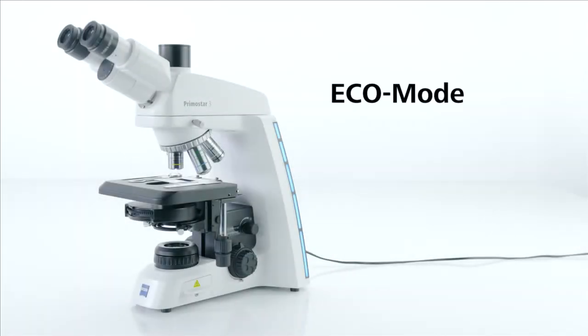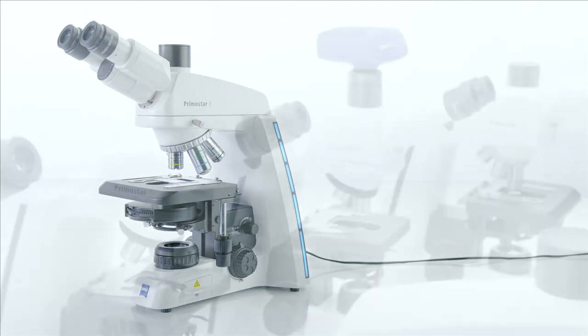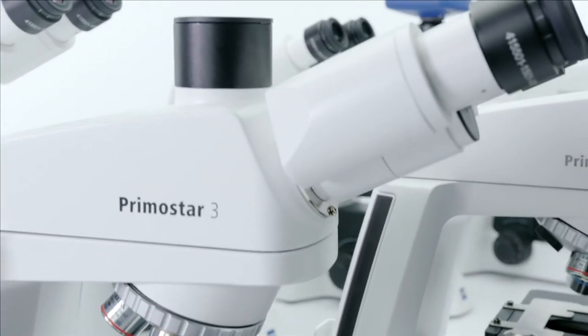That's when the Eco Mode on your PrimoStar 3 full-color microscope from Zeiss comes into play. Here's how it works.